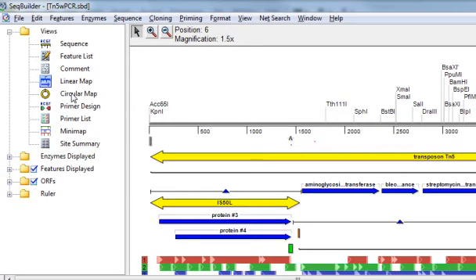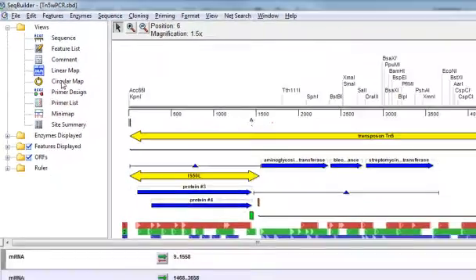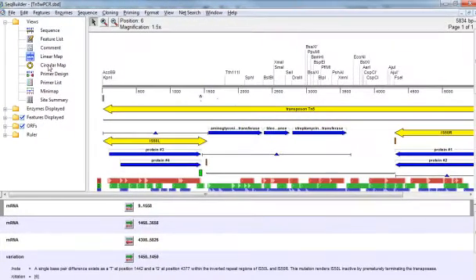Also, just to mention it, all of the views in SeqBuilder are synchronized, so that any changes made in one view are automatically reflected in every other view.